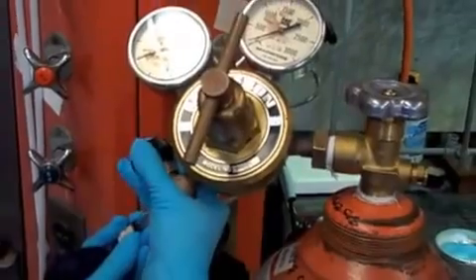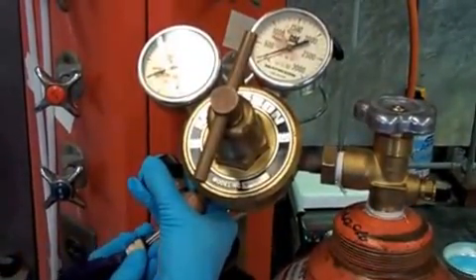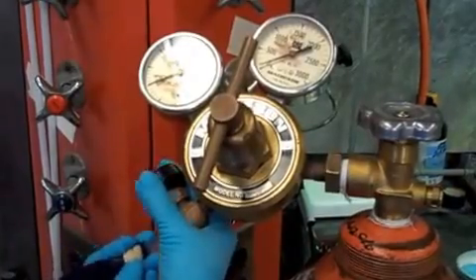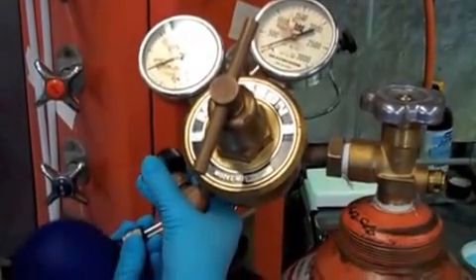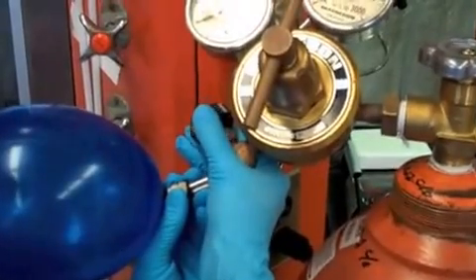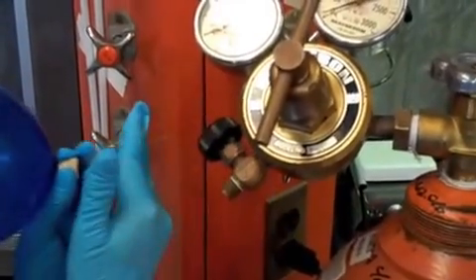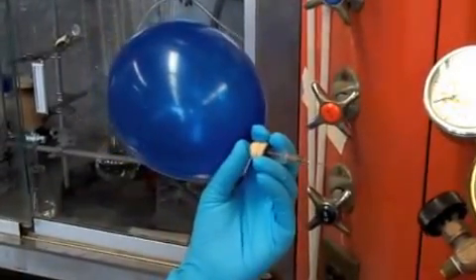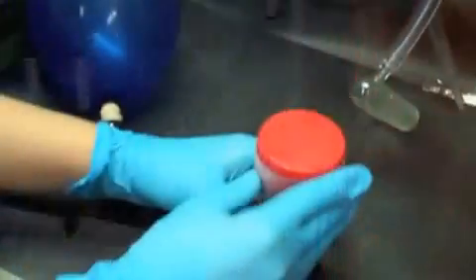It doesn't take much. You can just fill a little bit while you're purging. Now I'm going to fill up the balloon, and immediately place a black needle on it so all the argon doesn't escape during my travels.